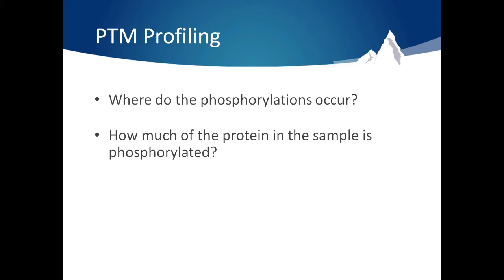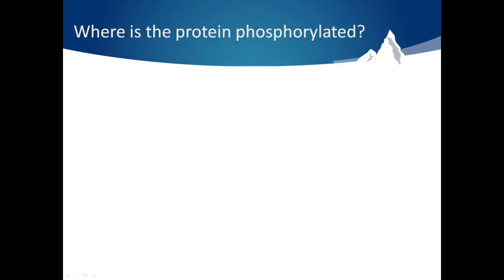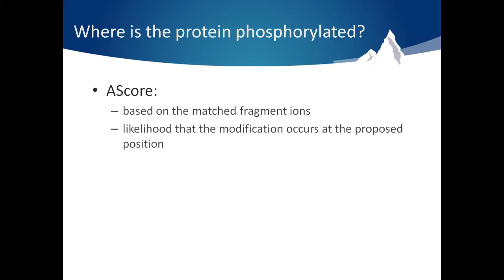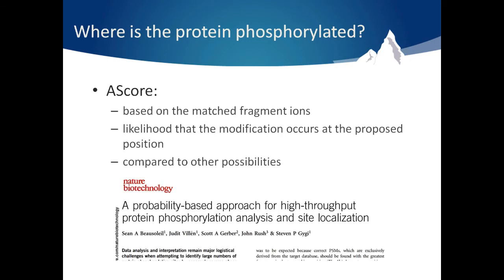To answer the question of where the PTM occurs, PEAKS provides an A-score for each proposed PTM. The A-score is based on the evidence from the fragment ions and is the probability that the modification is present at that position compared to other possibilities. Our A-score follows the guidelines outlined in the paper shown here.